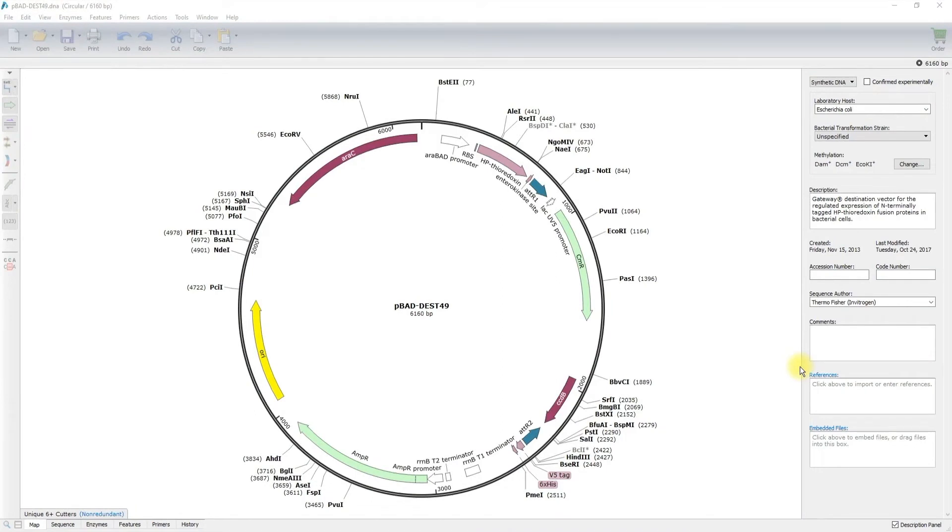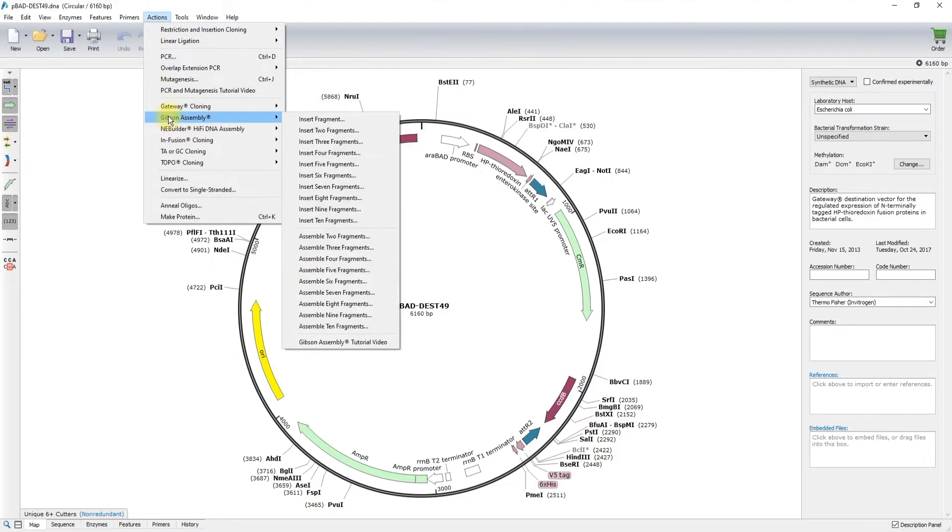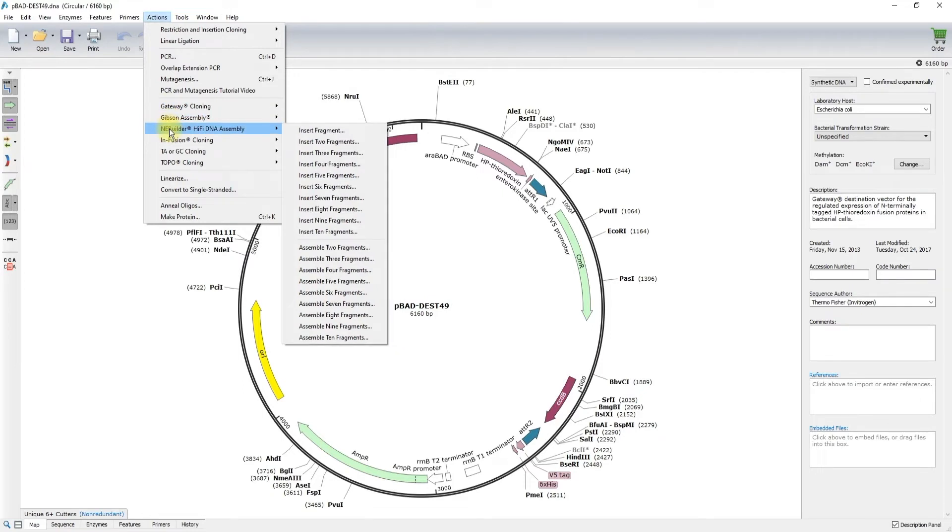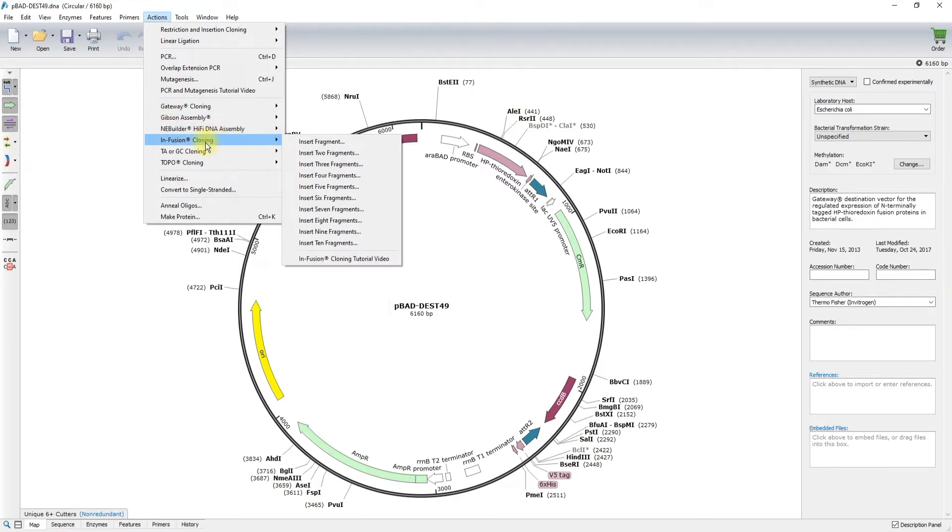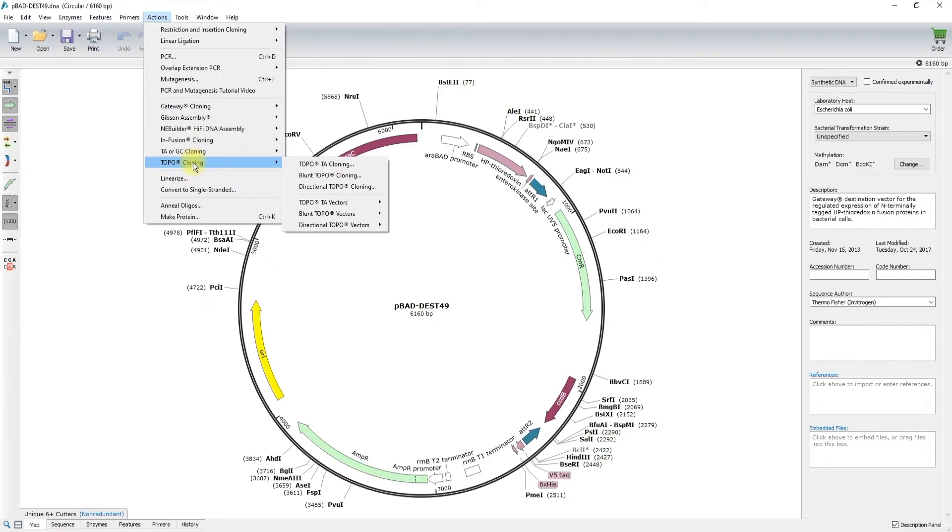You will use the SnapGene Actions menu to digitally clone your product. From this drop-down action menu, you can see the array of cloning techniques you have at your disposal, including restriction and insertion cloning, gateway cloning, Gibson assembly and its close cousin hi-fi DNA assembly, infusion cloning, as well as TA and topo cloning for the capture of PCR products. We will discuss all of these tools in SnapGene in detail in later videos.